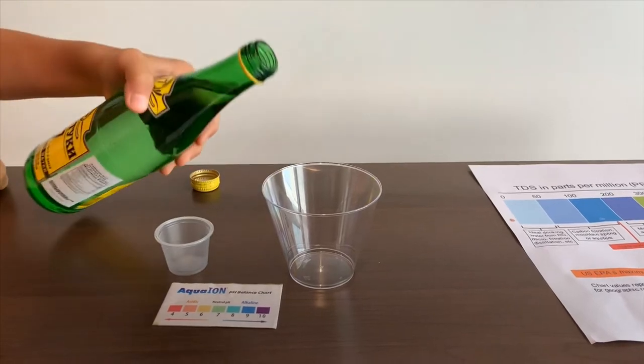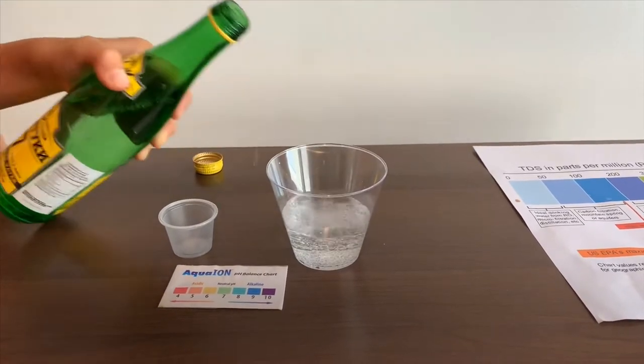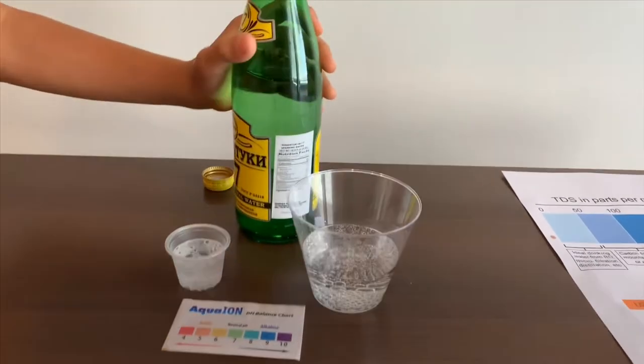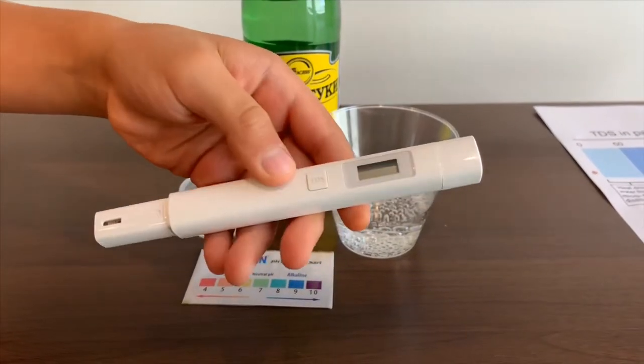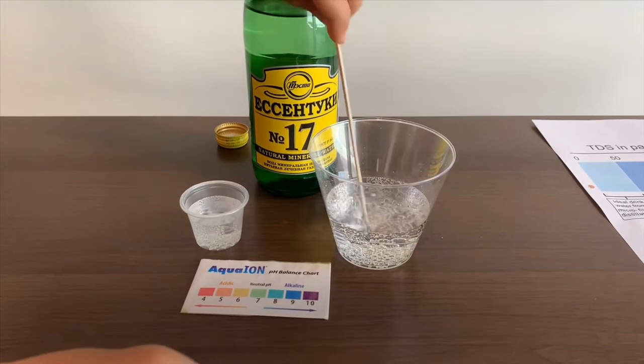Let's pour some water in. First, let's test the TDS level. If you want to buy this TDS tester, check the link down below. But first, let's stir it a little so we'll get a better result.